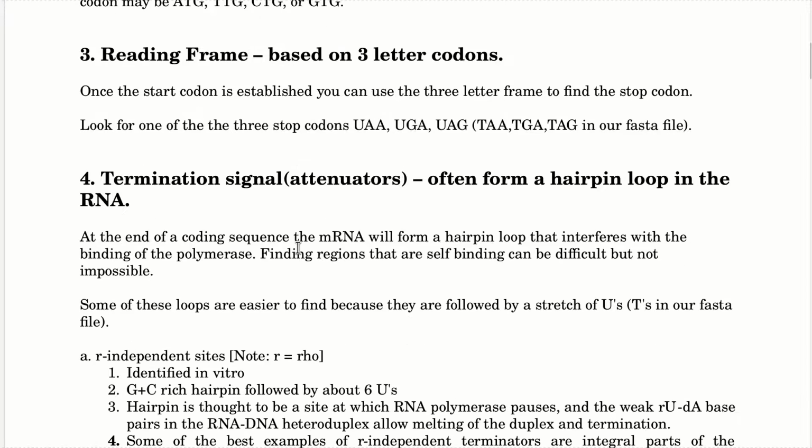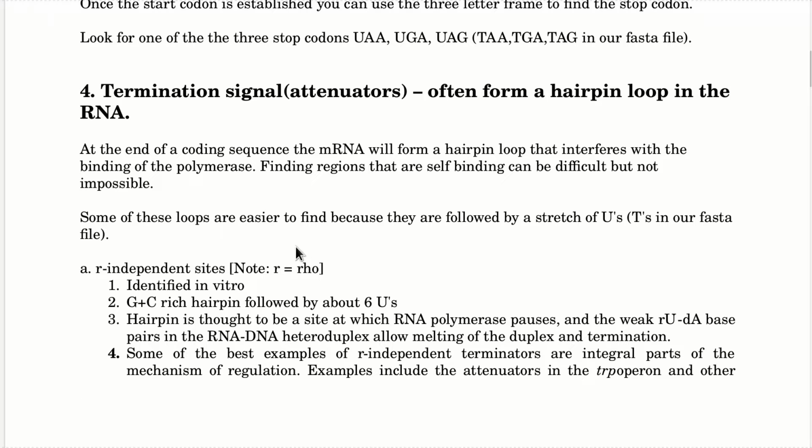All right. Now here I go into a lot of details on terminators. And if I hadn't used the word, there is attenuators.